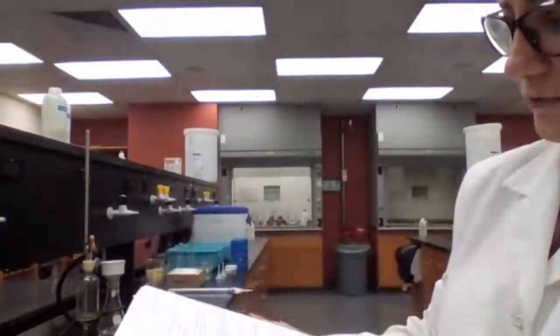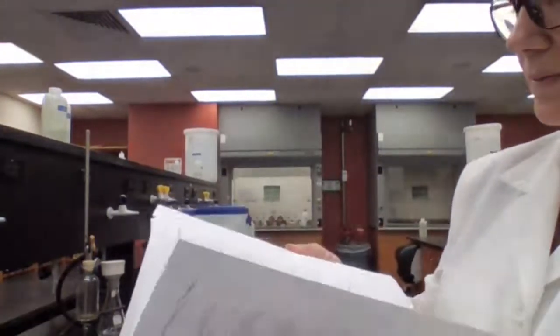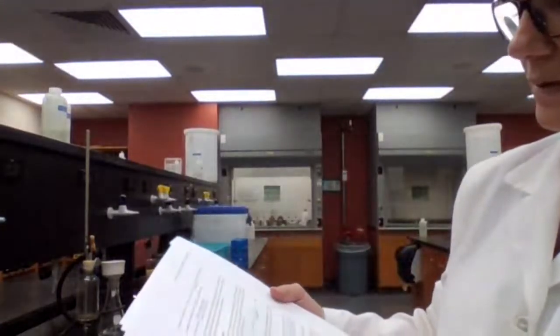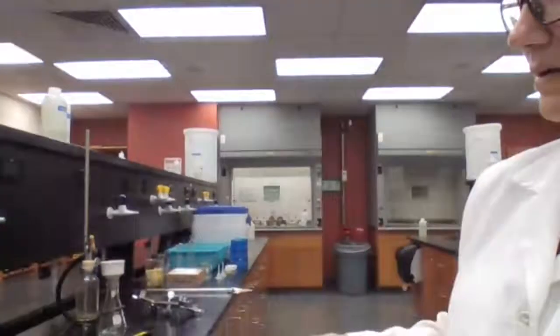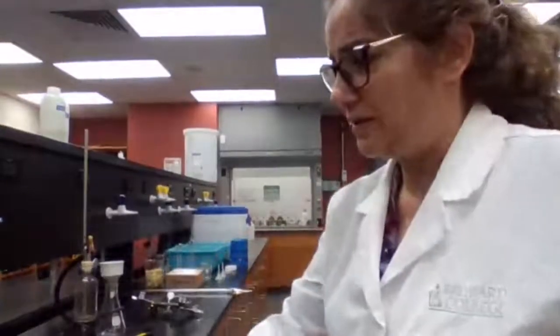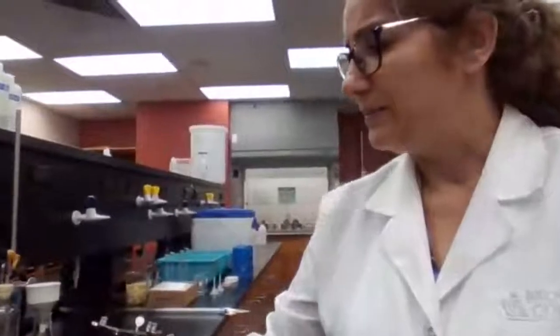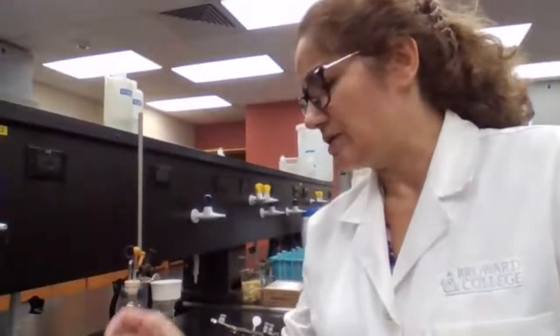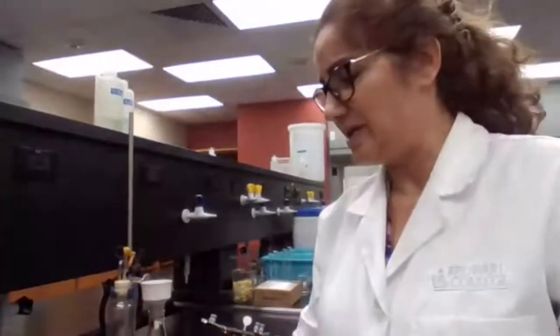Okay. Procedure for the experiment. We are going to do the carboxylic acid experiment first, and then I'm going to test for the amines also. So carboxylic acid, for solubility tests, we are going to test for solubility test first.